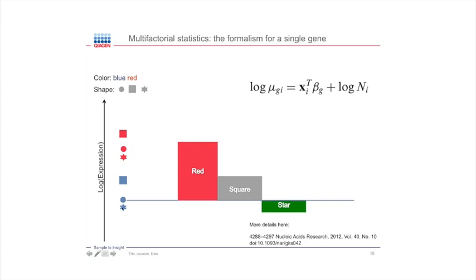And you've got then 6 samples and some expression in each sample for a gene. And the idea is that we choose one of these samples to be a baseline, and then we express the effect of the tumor compared to the normal with respect to that baseline, or of being one patient rather than the other with respect to that baseline. So we've got some fold changes. And it's easy in this case to sort of see, well, if I had this red rather than blue factor, then it's got a certain effect on the expression.